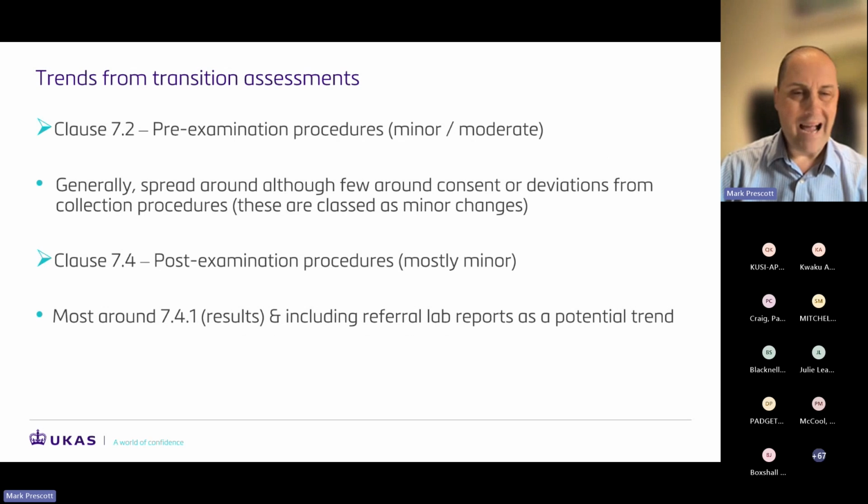A few more minor ones here. Clause 7.2, pre-examination procedures. No particular trend within the trend, if you like, here. There's a variety of sub-clauses. Some of them are minor changes, some of them are moderate changes. We are seeing a few non-conformities around patient consent or deviations from collection procedures, but nothing that particularly stands out.